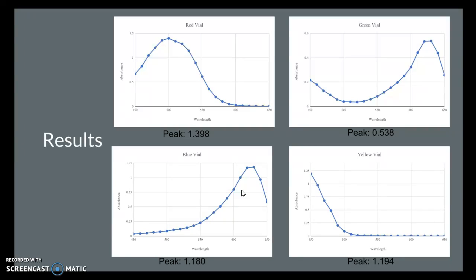Now our results were really cool. So on the lower end of the spectrum, I should say the higher end because smaller wavelengths have more energy, on the ultraviolet range, yellow, visible light range, that's about yellow, starting at 450 and 500, it was absorbing a lot of the other colors that were not red. So as we got to infrared and red, those lights were then transmitted. They were transmitted through, because the way light works is anything that is not being shown is absorbed, and anything that is being shown is transmitted or reflected, and that's what your eye sees.